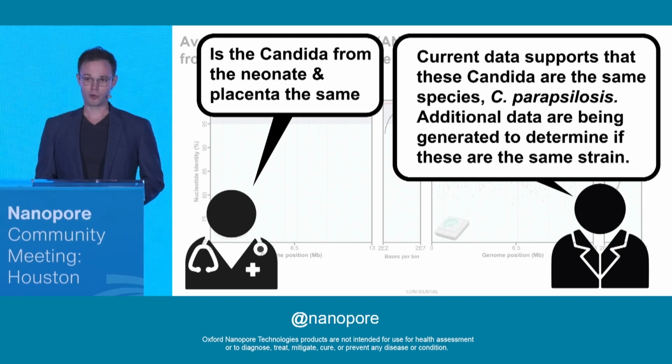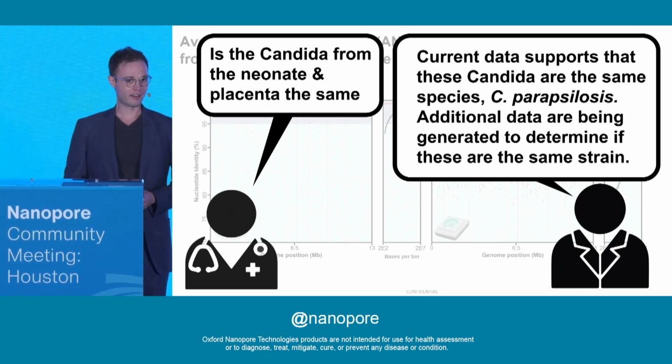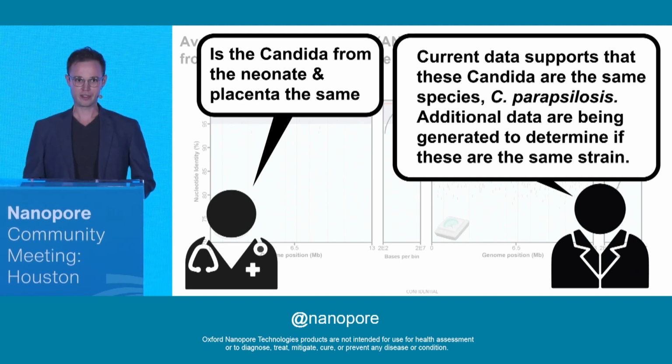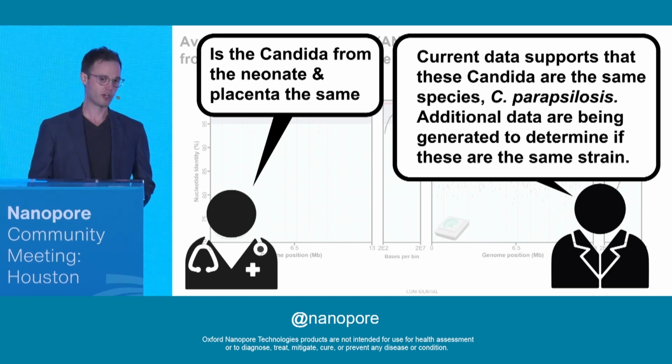Therefore, returning to our original question, are these budding yeast or Candida the same? Our current data supports that these Candida are the same species, C. parapsilosis. However, these data are insufficient to determine if they are in fact the same strain.